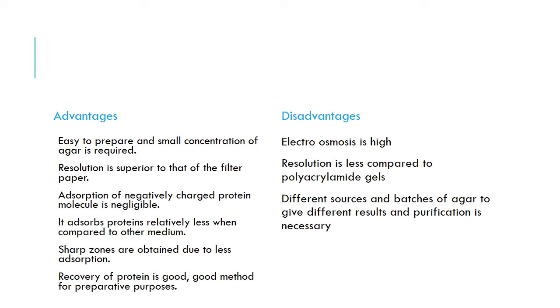Okay. Now, what are some of the advantages and disadvantages of using agarose gel electrophoresis? When you talk about agarose electrophoresis, the gel itself is easy to prepare, and only a small concentration of agar is required.